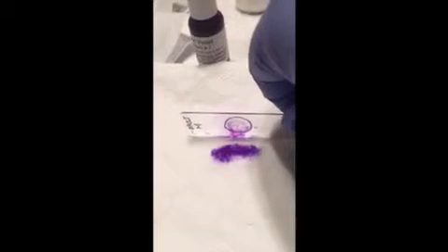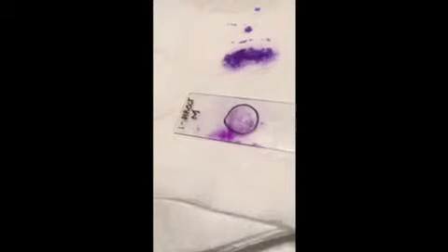Alright, it's been 60 seconds. Just going to wash it a little bit. Now we're ready to view it on the slide.